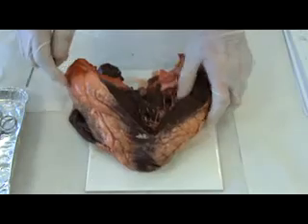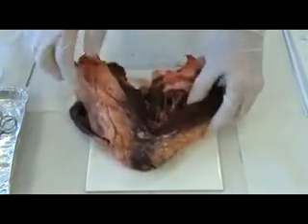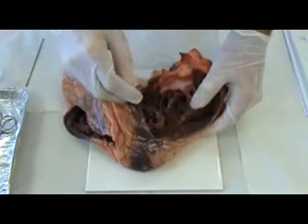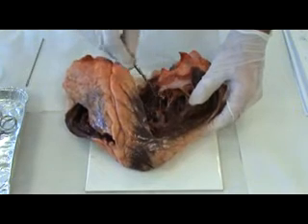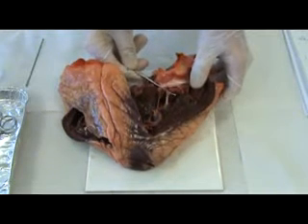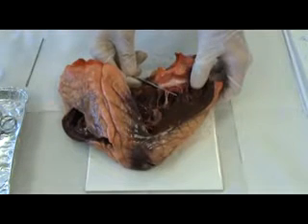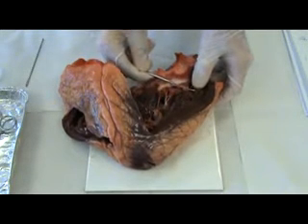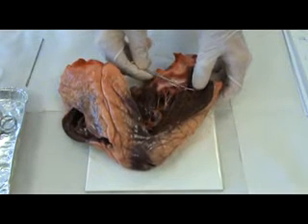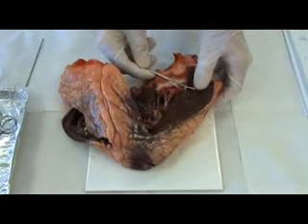The left atrium leads down to a valve, which is here. This is the valve, and this is the bicuspid valve, and attached to the valve are these very tough fibrous strands, and if you put the probe there and pull it gently, you can feel how tough they are. Try some there. There you go. Quite tough. These are the chordae tendineae, and they are in essence helping the valve stay in its position.